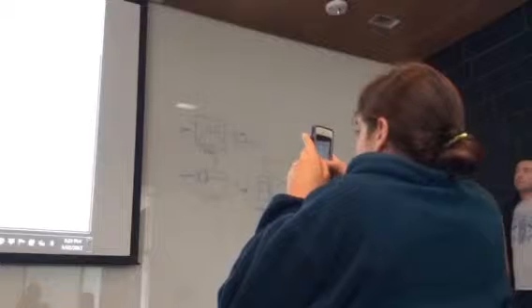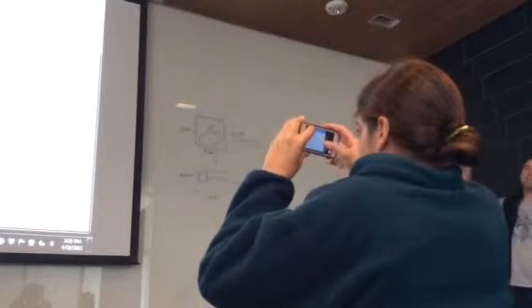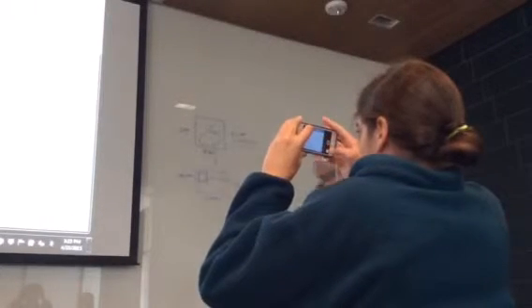So what we want to do is go through all of these different subsets, placing in the gates, and then calculating the frequency of the 6 different populations of cells, which are highlighted here. The ones in blue are the MPPs, short-term, long-term, and then off of the CD34 positive, CD38 positive, you want to get off of here and do this gating strategy to identify CLPs, GMPs, and CMPs.